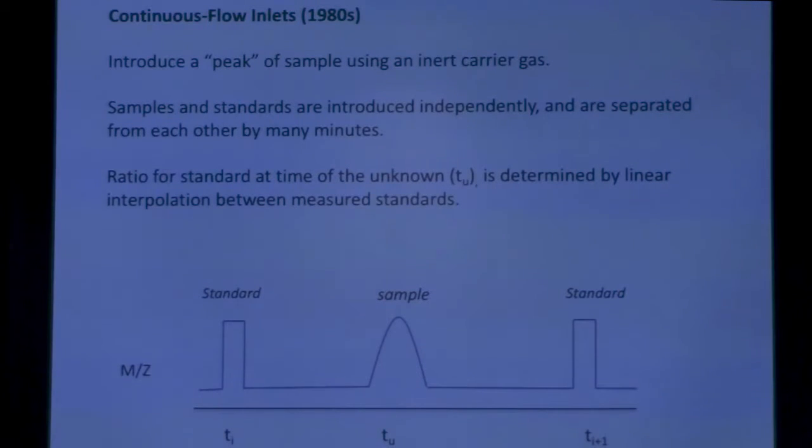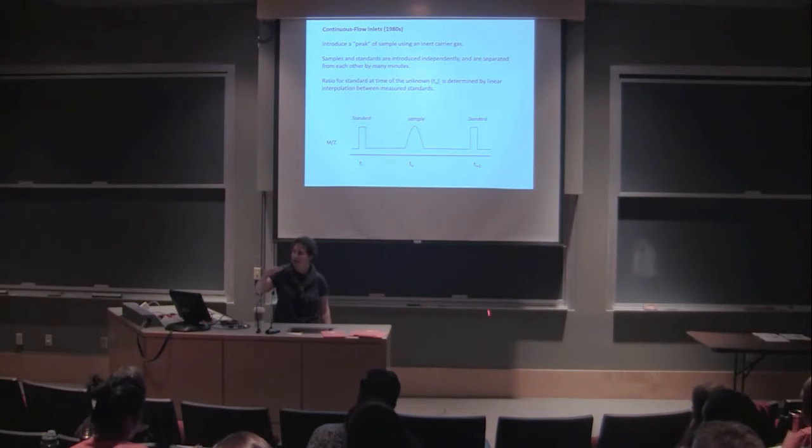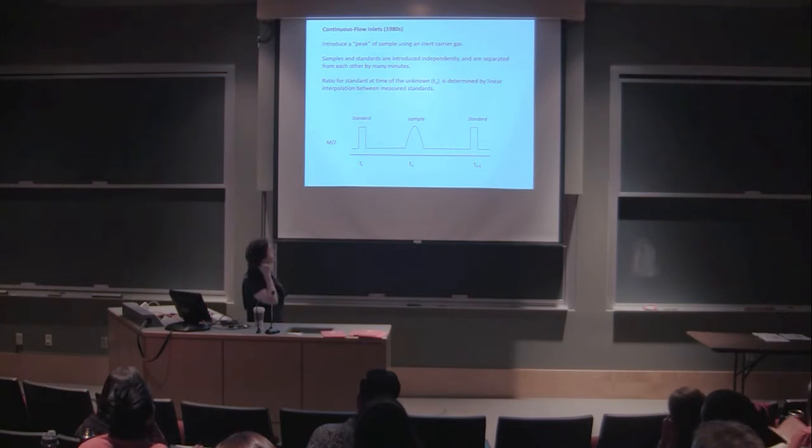So drift is accounted for over this time period by this interpolation method. And that's buried in the software, you never have to think about it as a user, but it's good to know that if you have one standard that's kind of wonky, and one standard that's pretty good, your instrument will use both of those values, wonky or not. So understanding what's happening can empower you to make good decisions about how to use the information.